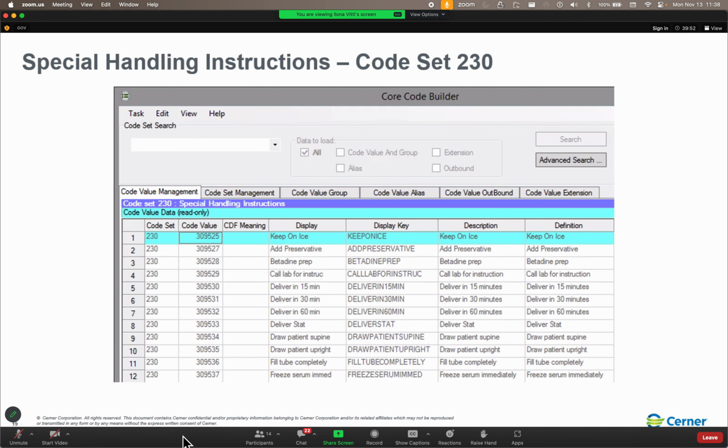Now, if you are in department order entry, you're placing 5 orders, they all have the same accession class, they all have the same accession format, they've all got the same requested start date and time, there's a pretty good chance that they are going to have the same conversation ID on the netting table. Pretty good chance that all 5 orders will be in the same data packet that we send to the netting server.